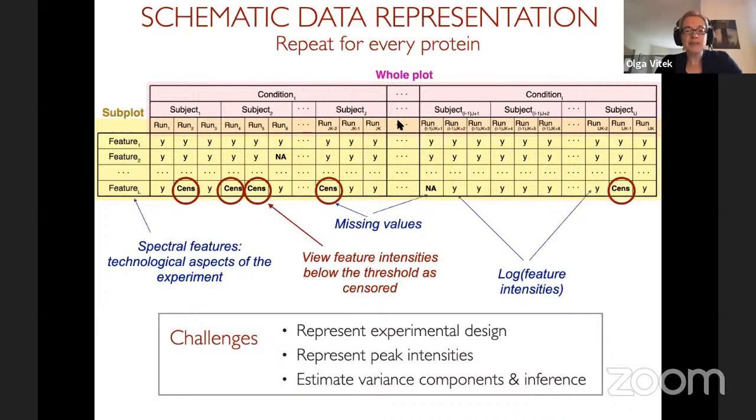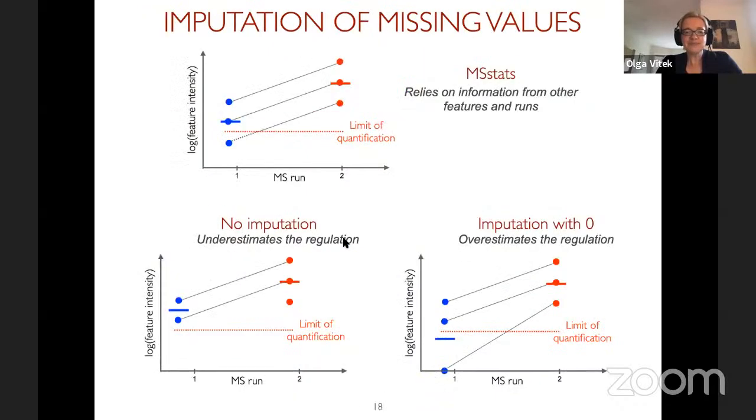What is the difference between assigning a value 0 or as a missing value? Hold on, I will answer this in the next slide or in a couple of slides. So actually right now, here we go. So let's talk about that.